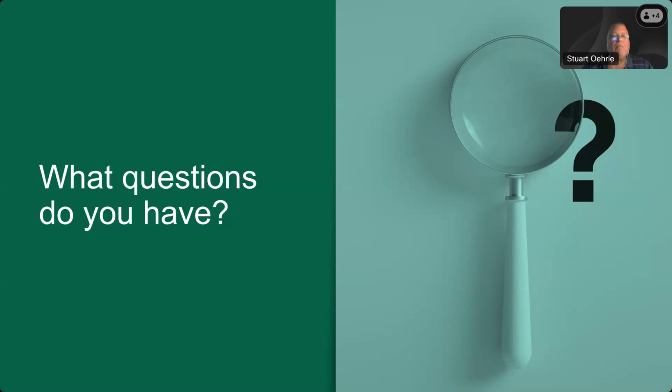I would agree. What I believe is being asked is almost like an omics-based targeted workflow with LC-MS, which you could do. We would probably encourage you to reach out to somebody else from Waters, and we can connect you with those kind of people if you reach out after and have some further discussions on that.